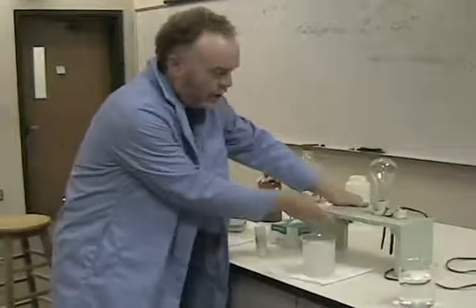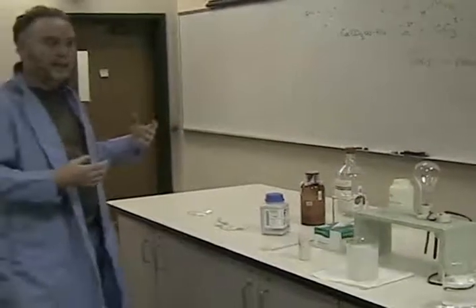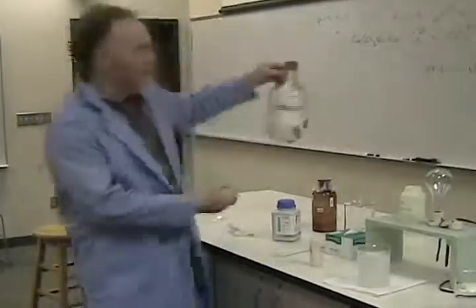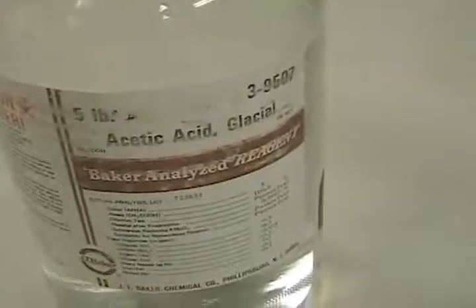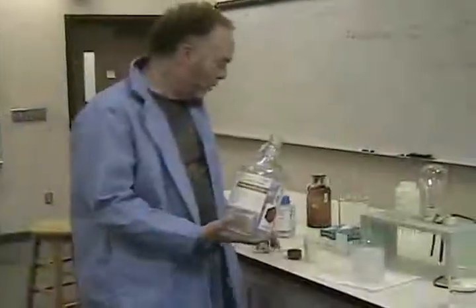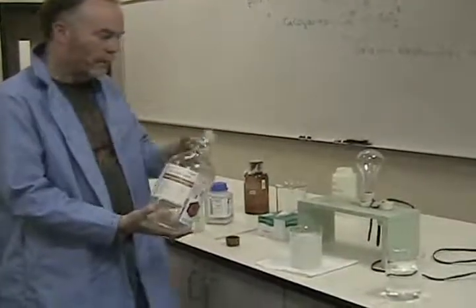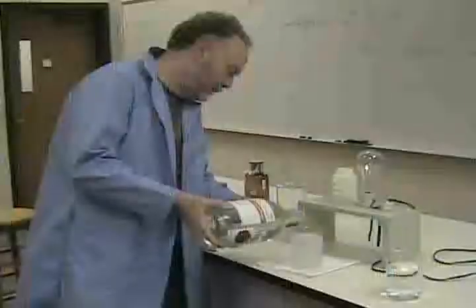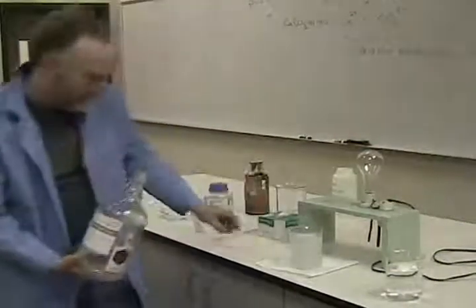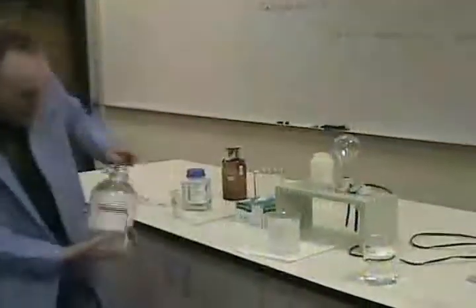Now we can change all this. In other words, we can facilitate or make the calcium carbonate dissolve by just adding a little bit of acetic acid to the solution. Now, you guys probably know about the Berkeley pit and all the metals. Well, all those metals are generally insoluble compounds as well, but when there's a little bit of acid here, we'll probably see a little bit of foam here from the reaction producing some carbon dioxide.